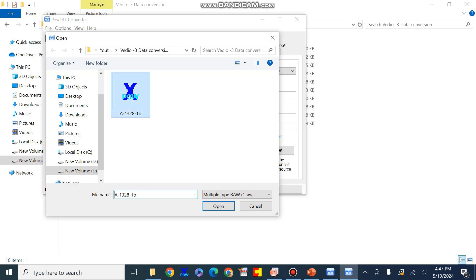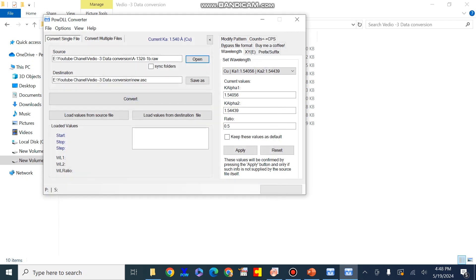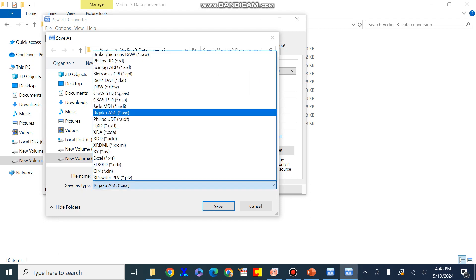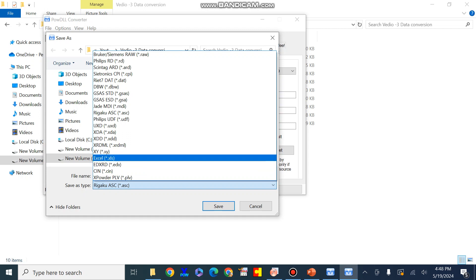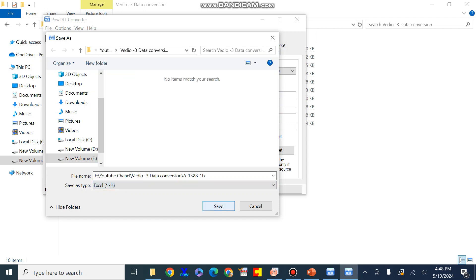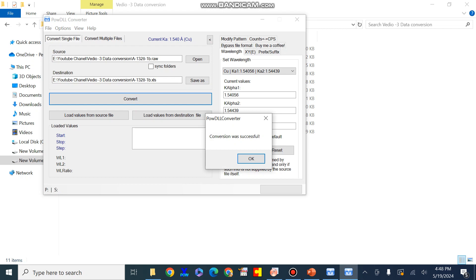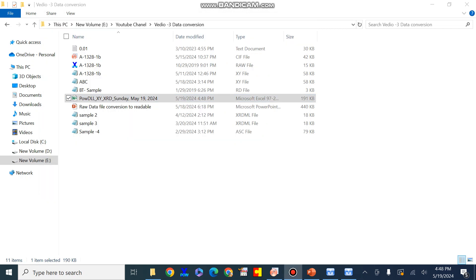Since this raw data file cannot be supported by Origin, I will convert it into another format. Just press Open and then convert the raw data file into the desired format — here I will press and convert this file into the Excel or XY file format. I will simply convert it to Excel file format, then press Convert. We can now see that the conversion was successful.